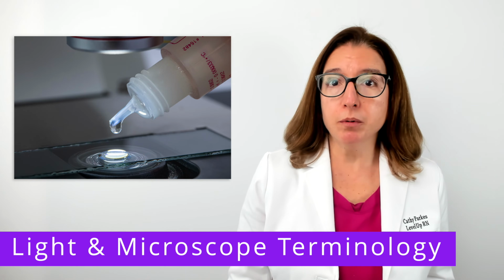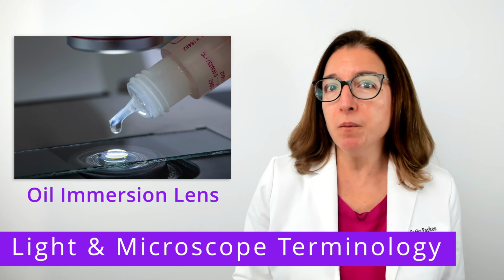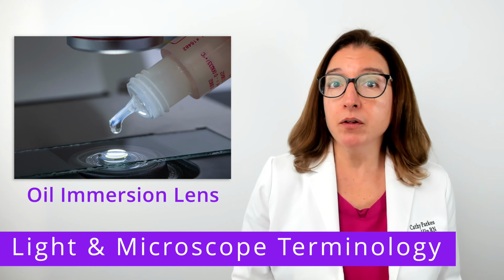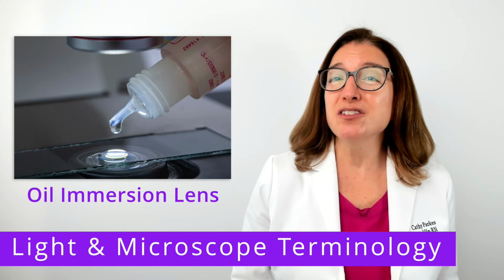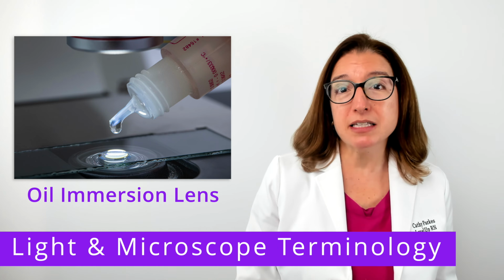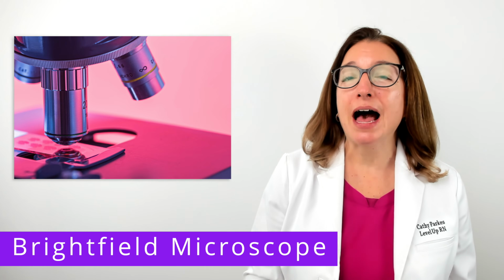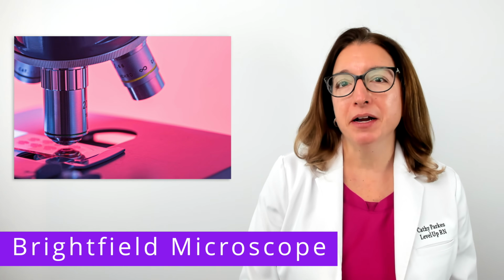To solve this problem, we can use an oil immersion lens with a drop of oil between the lens and the specimen. Because oil and glass have a similar refractive index, this allows more light to pass through the specimen, which improves resolution.